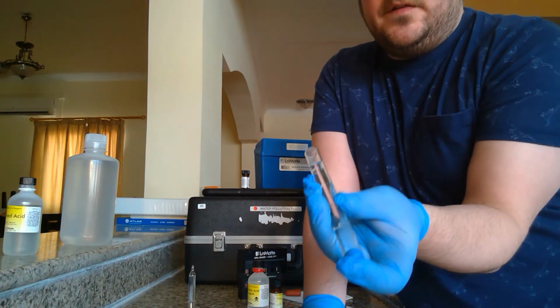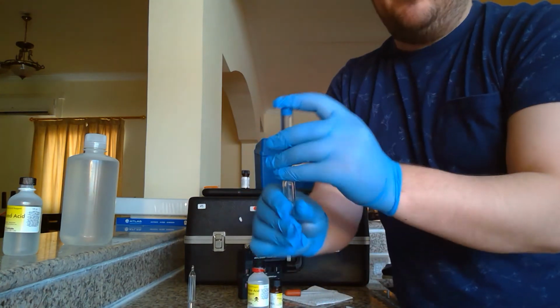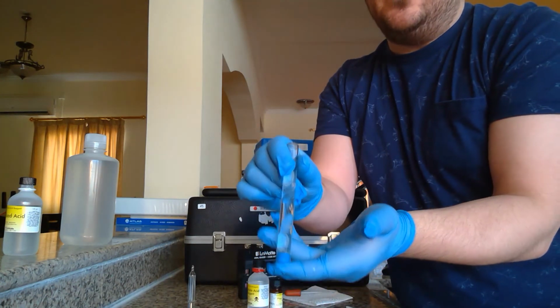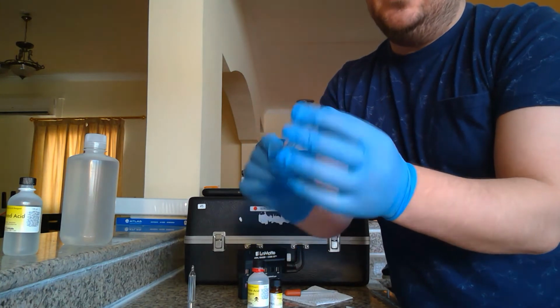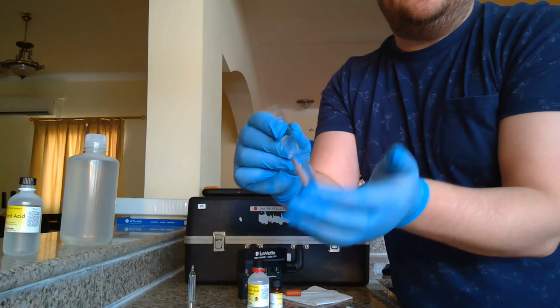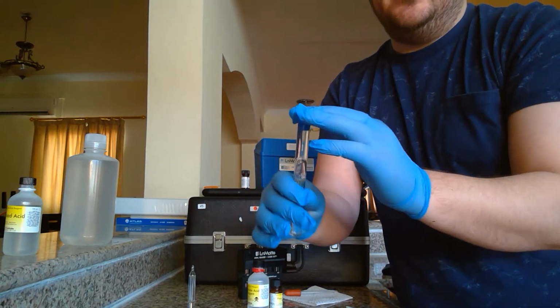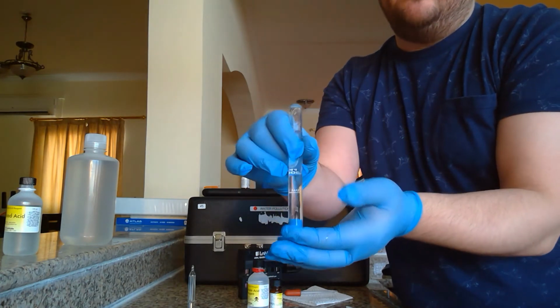So I'm just going to mix this around. I still see some of the reagent in there, so I will cap and invert a few times. It doesn't say how many times. It just says cap and mix until dissolved and then wait 5 minutes. So I'm going to do this a little bit off camera, and I'll be back in 5 minutes.